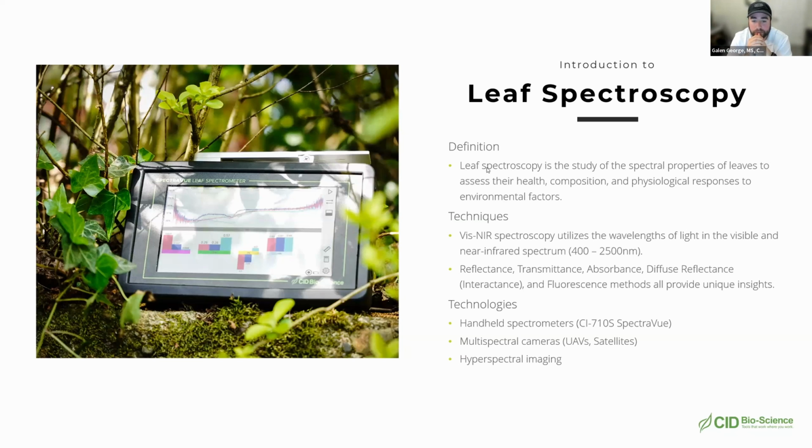The next question, what could be your advice in using it for spectral profiling of a specific tree species among many others? If you're just trying to do spectral profiling, the biggest thing, like I just said, is subsampling and making sure you're sampling diverse enough locations on the tree, and getting as much sample as you can to get a good average idea of what's going on throughout the entire tree.